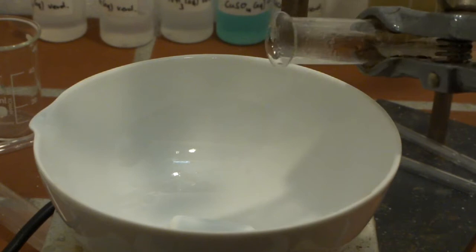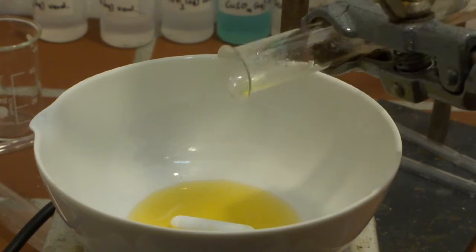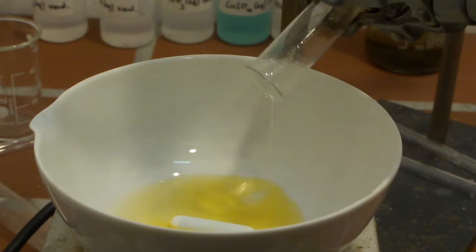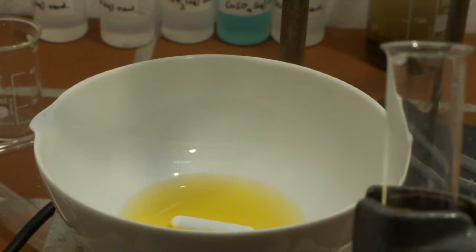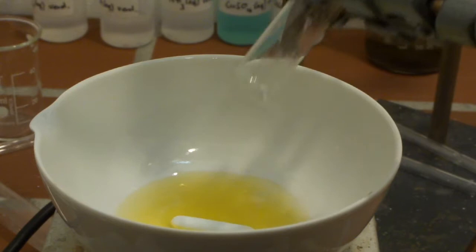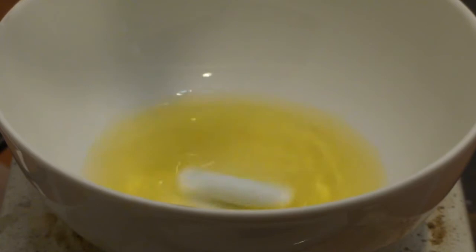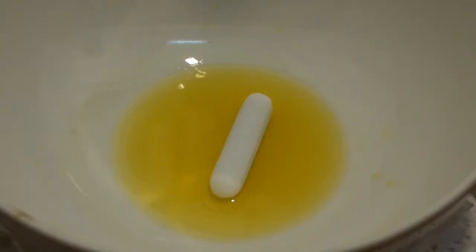This is our hexachloroplatinic acid. We now need to get rid of excess nitric acid. For this, transfer the mixture to an evaporating dish. Add some concentrated hydrochloric acid, boil it down to a syrupy consistency and then repeat the process until no more nitrogen oxides escape from the liquid.